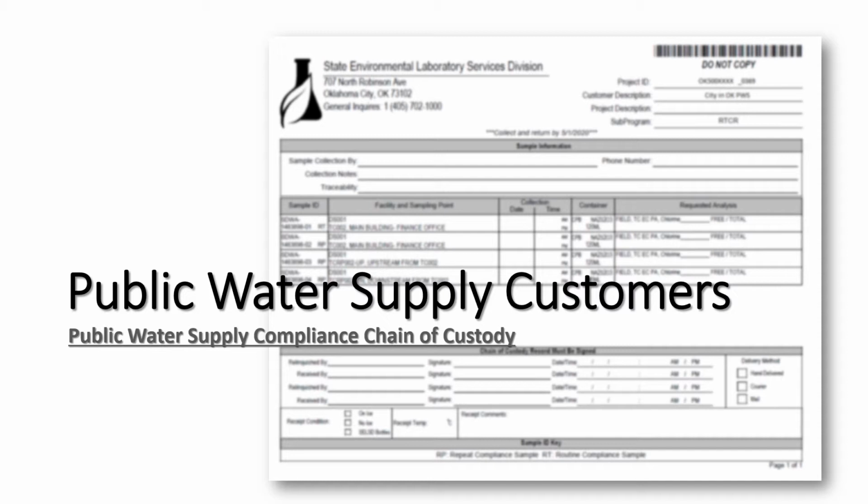Compliance samples are scheduled and logged before the monitoring period begins. Laboratory staff will send you the chain of custody, labels, and containers for each schedule that your system is required to submit samples for if you use the DEQ State Environmental Laboratory.